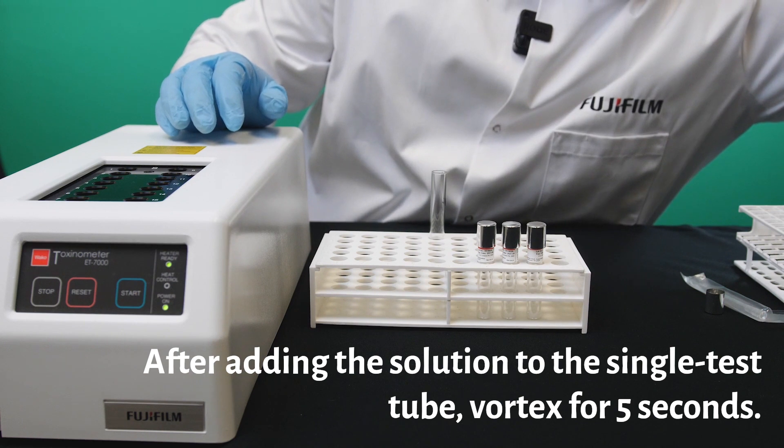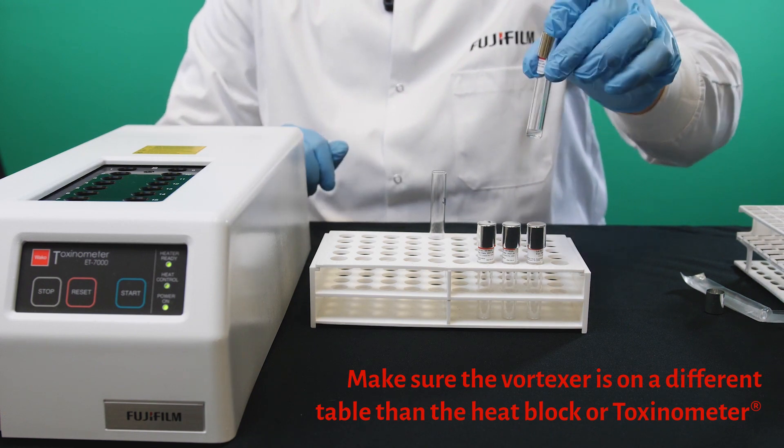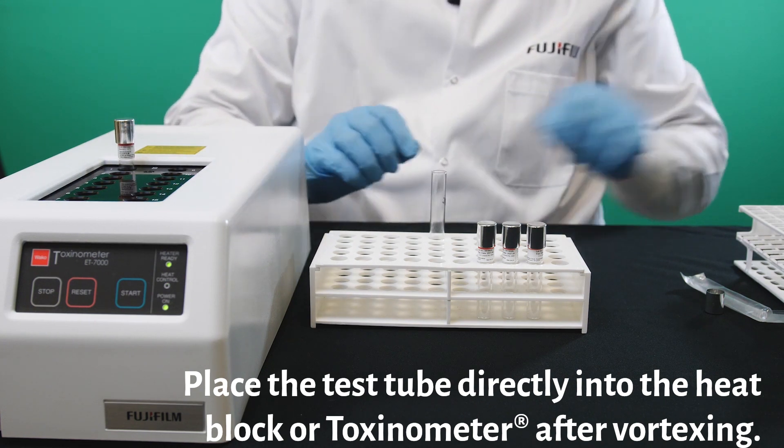At this point, it would be vortexed. This is going to be off camera because it shouldn't be on the same table. Now we are ready to take this and insert it into the toxinometer.